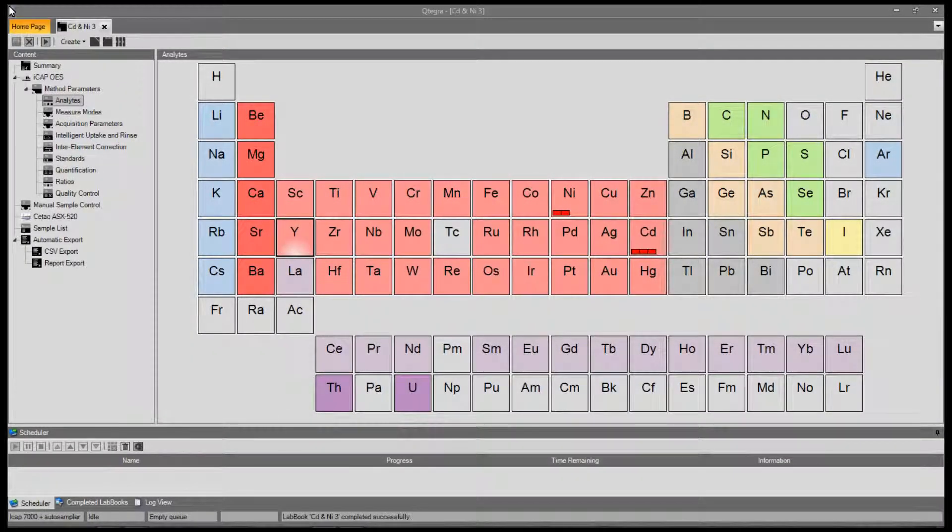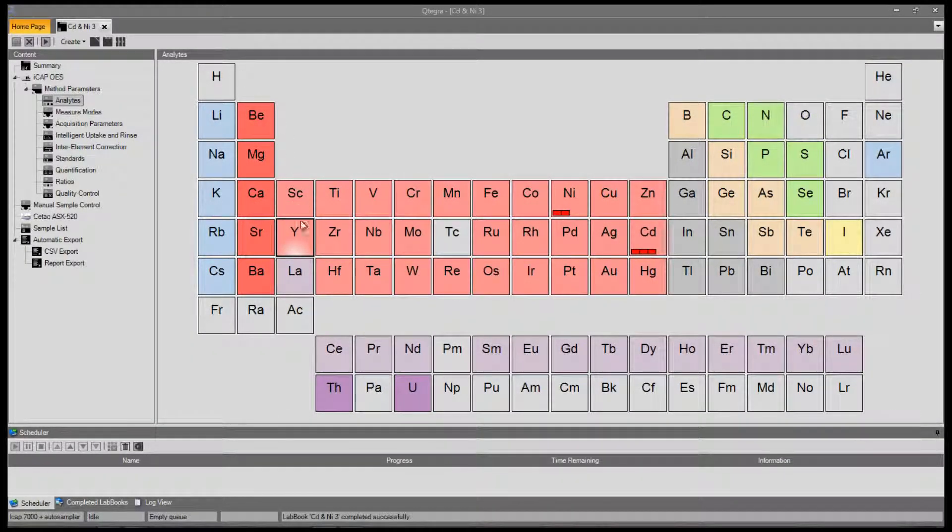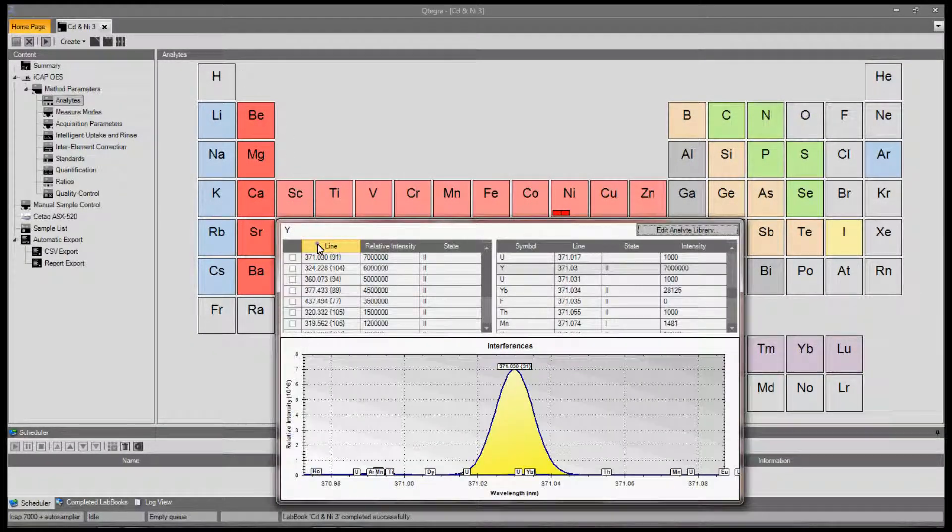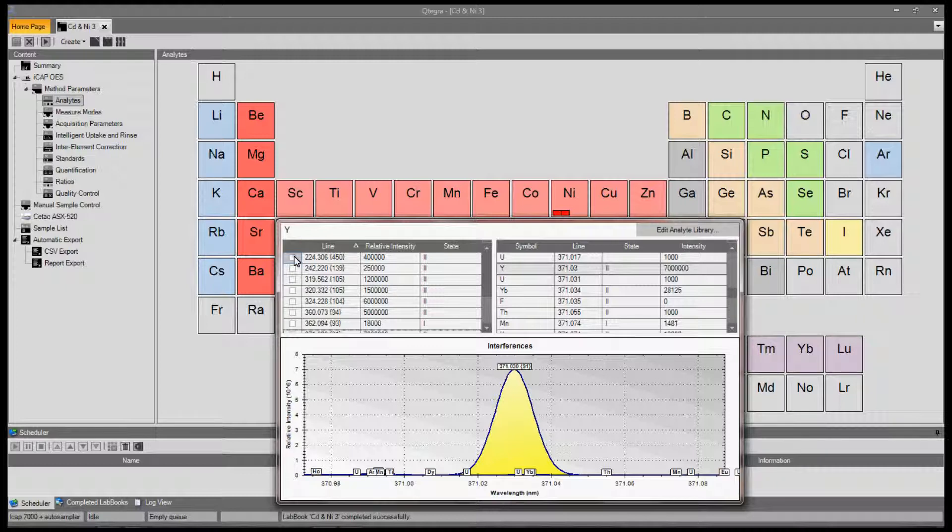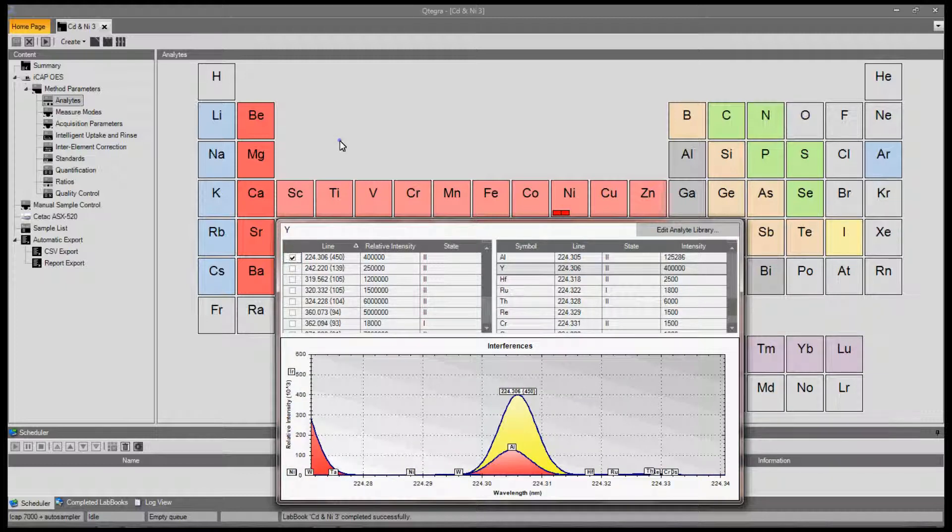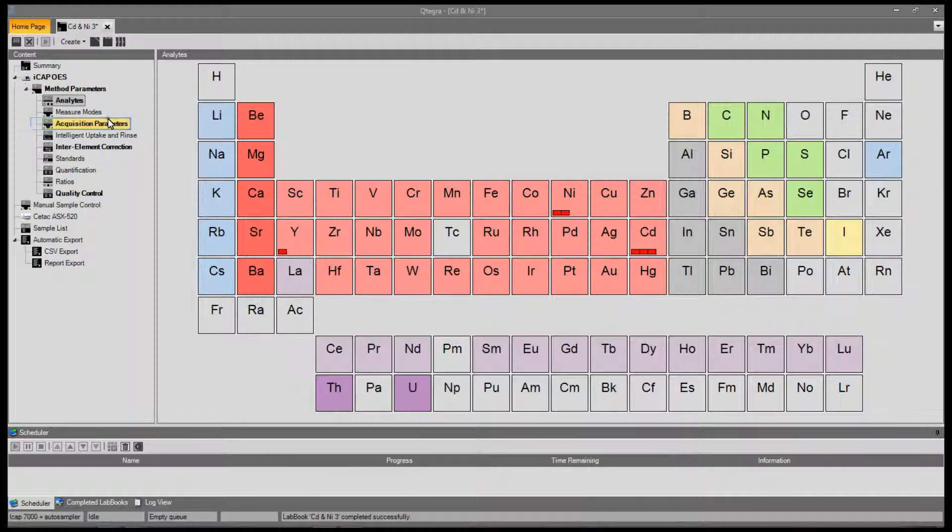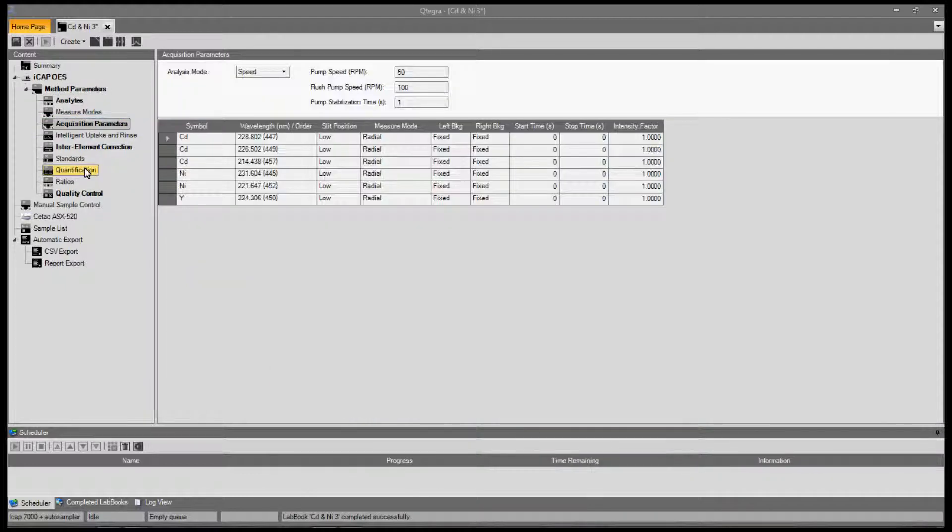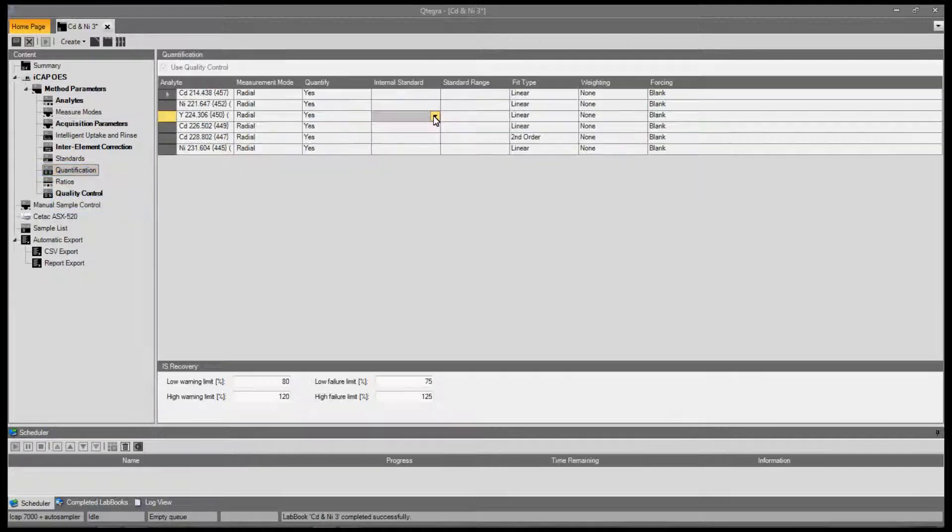To set up an internal standard, first we must select the emission line or lines we wish to use. The internal standard lines must be matched to the analytical lines by slip position and measure mode.